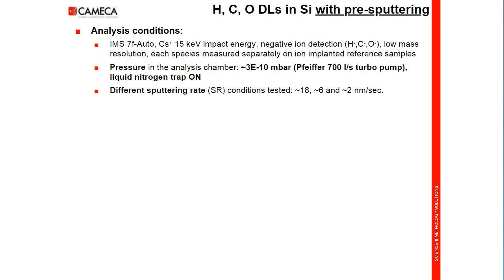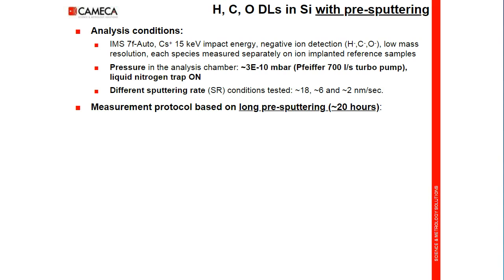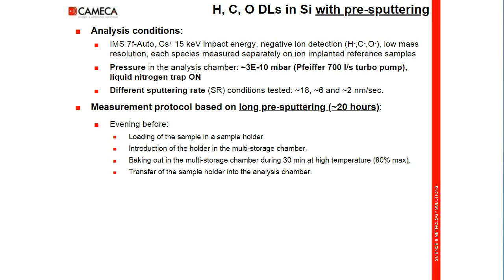The measurement protocol was based on long pre-sputtering, around 20 hours. The evening before, the sample was loaded in a sample holder. The holder was introduced in a multi-storage chamber and was baked out for 30 minutes at high temperature. The sample holder was then transferred into the analysis chamber.